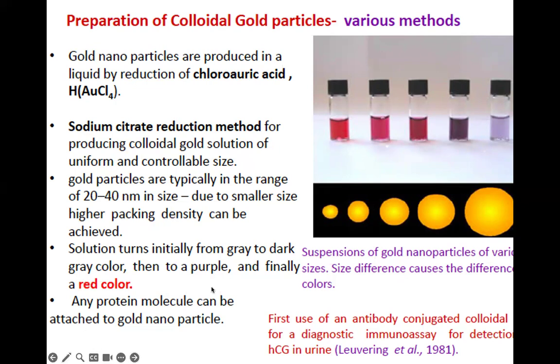And very important, if you prepare gold nanoparticles, please don't stock up a lot because it's not that stable. It's best for you to prepare in small batches because it needs to be fresh.